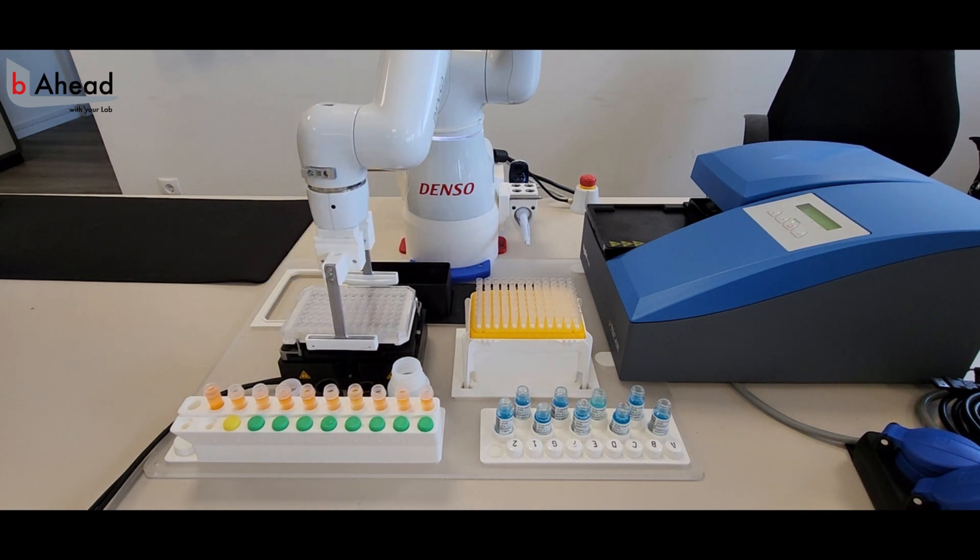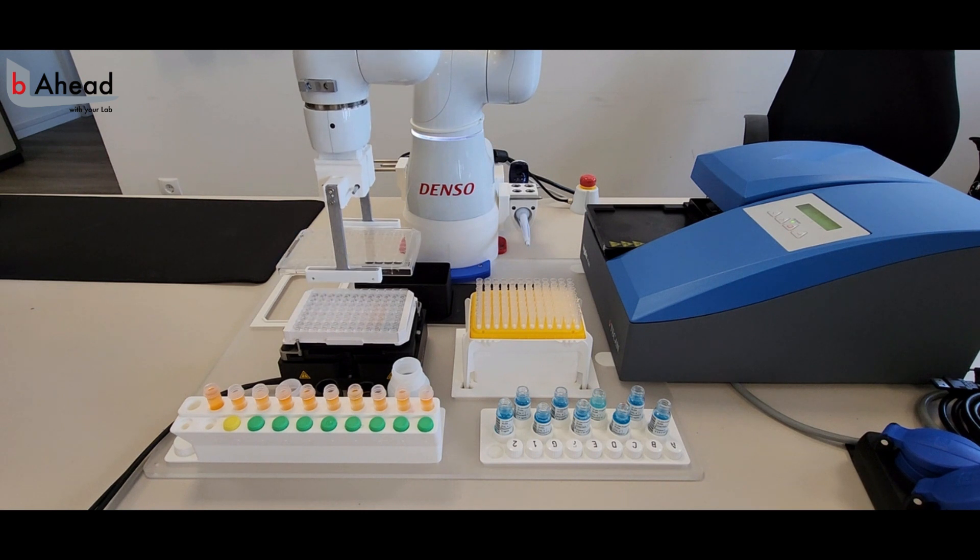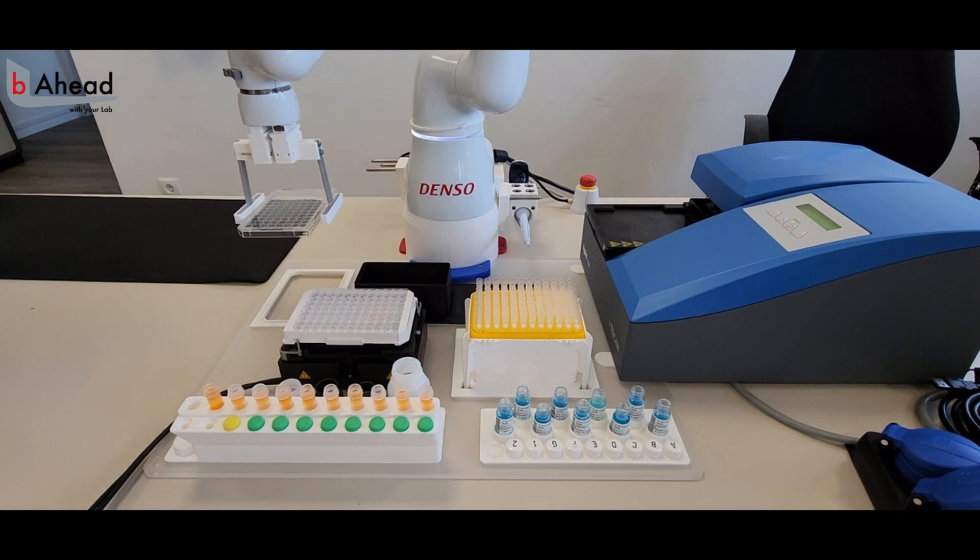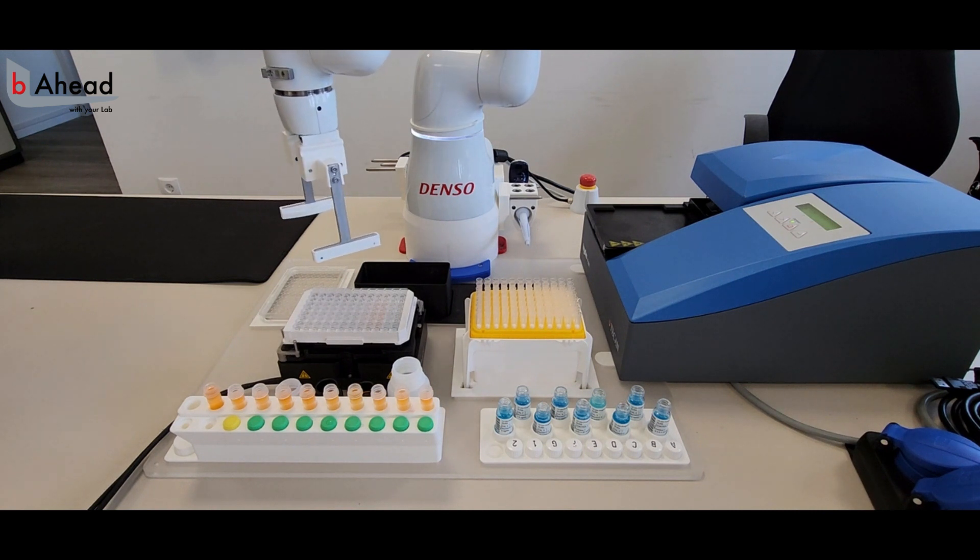We have skipped the incubation process for demonstration purposes and continue with buddy taking off the lid before placing the microplate into the washer on the right side of the picture.